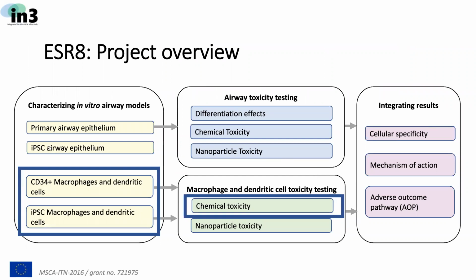The initial goal of my project was to develop an iPSC derived airway epithelium. However, due to difficulties in establishing a fully differentiated epithelium on the air liquid interface, the focus has shifted to primary airway epithelium as well as iPSC and CD34 derived macrophages and dendritic cells.